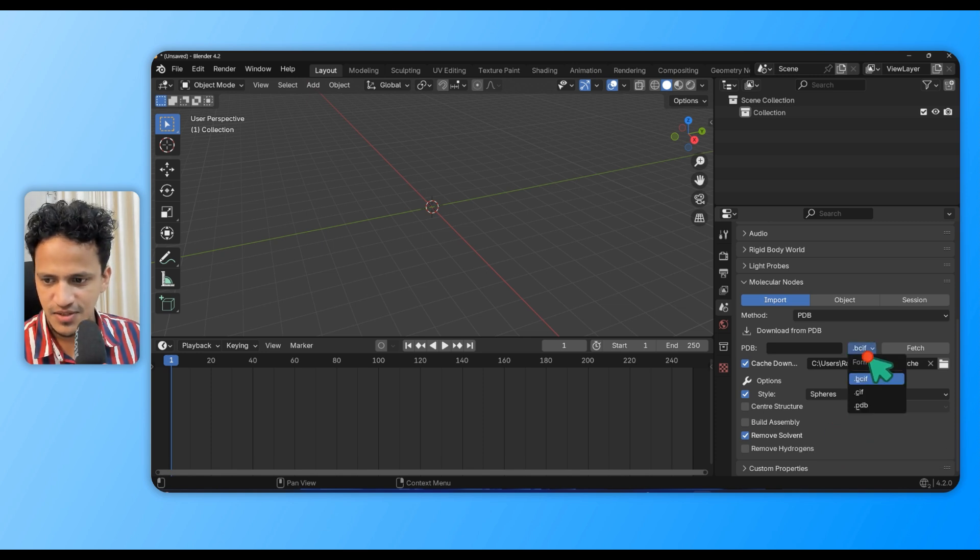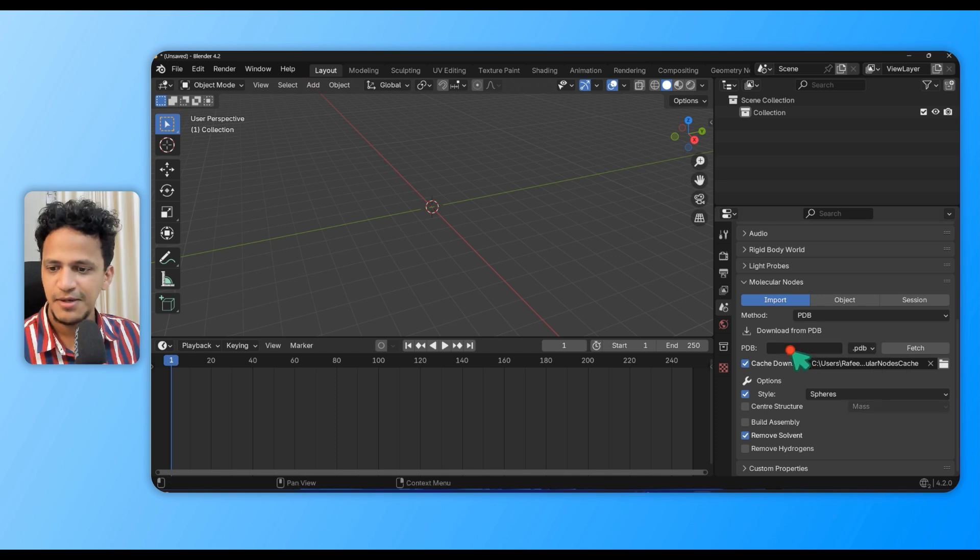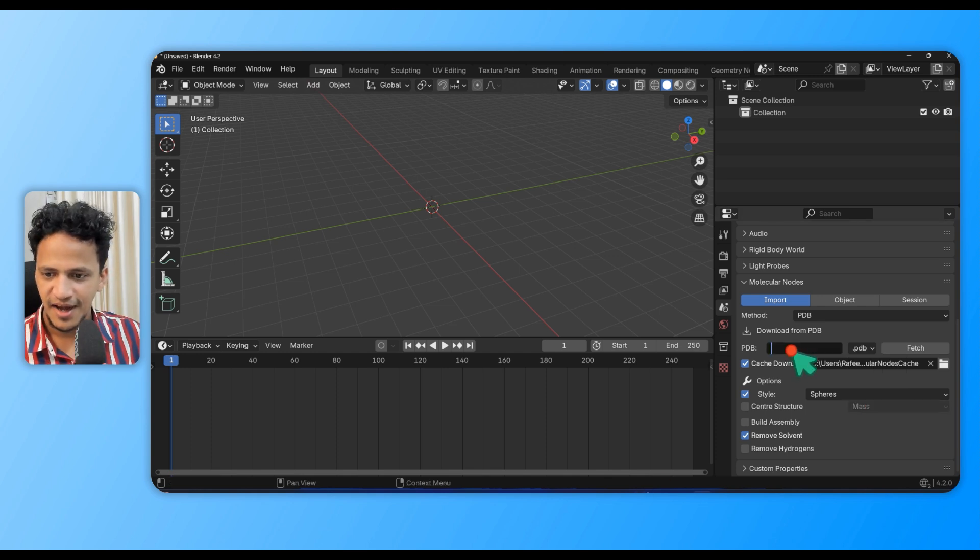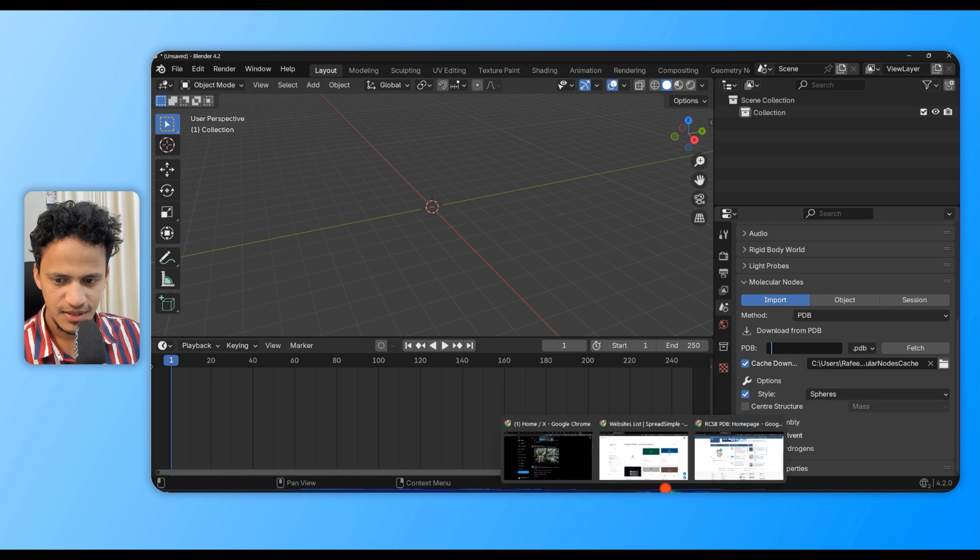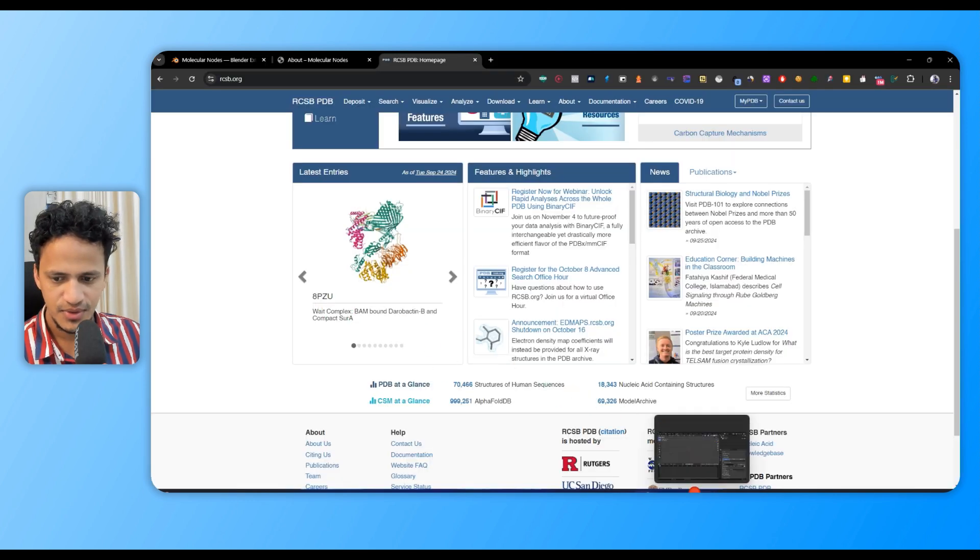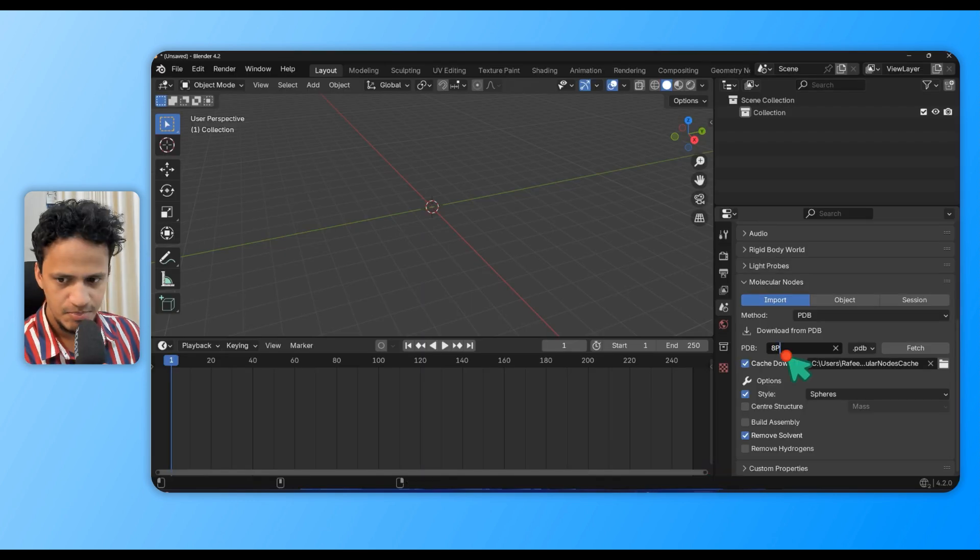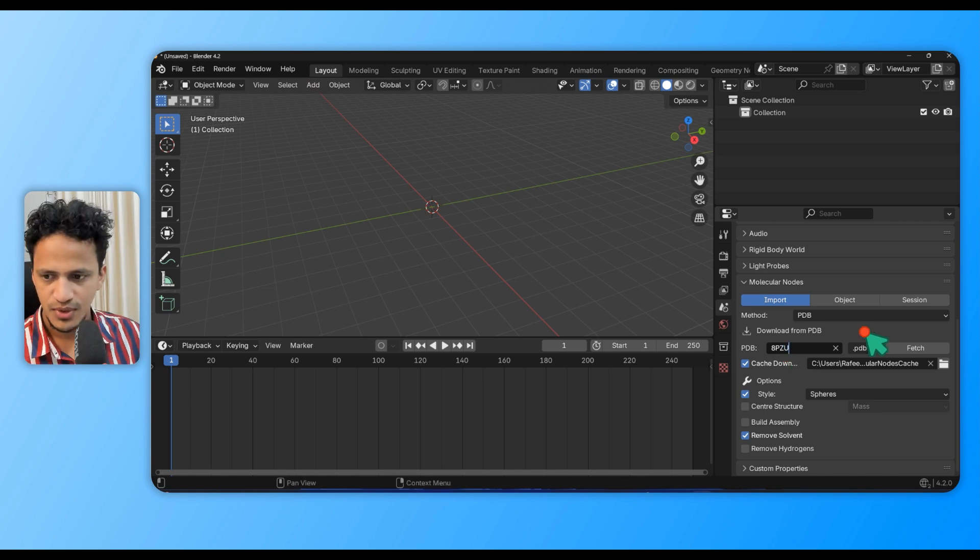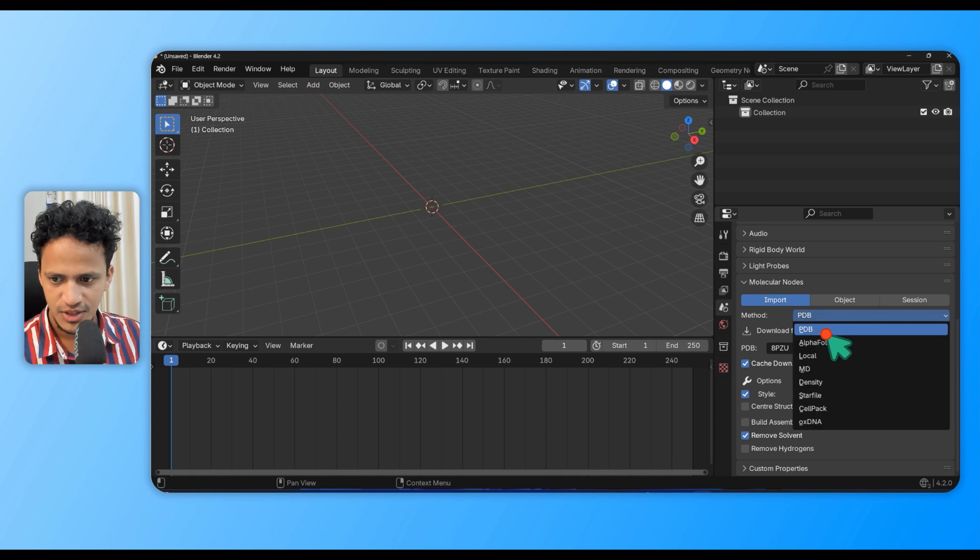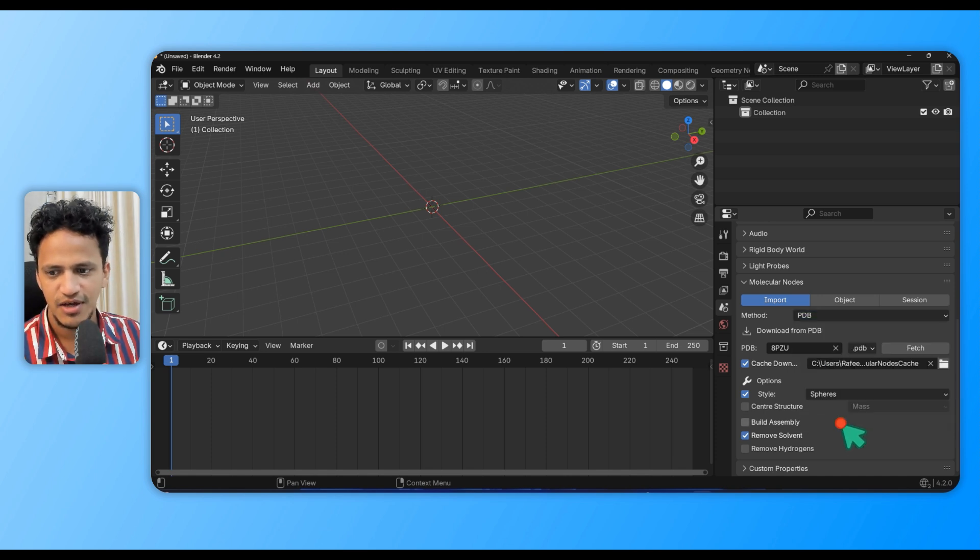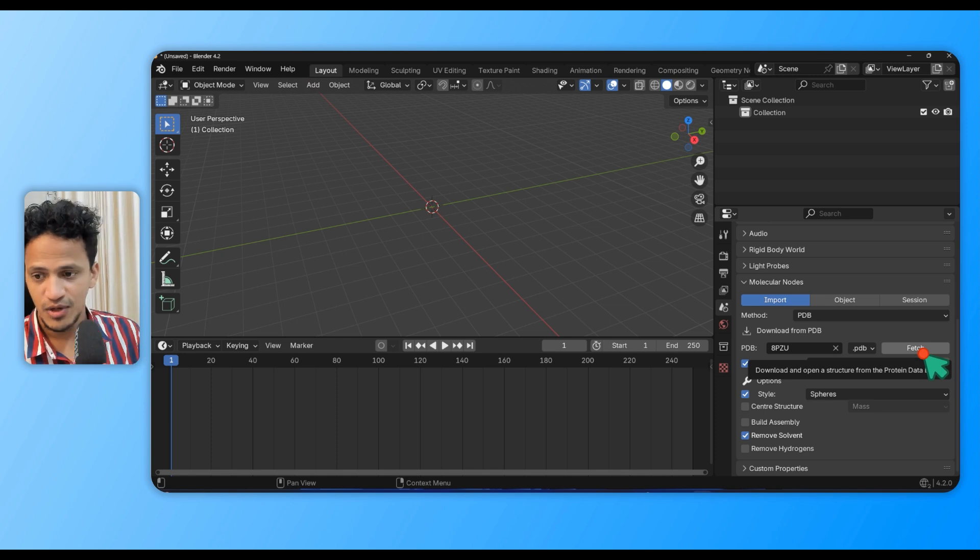Let's import a PDB structure quickly. I'll change this to .pdb and type a random PDB ID of a protein from Protein Data Bank: 8PZU. Make sure that the file format is PDB here, and here also it is PDB.